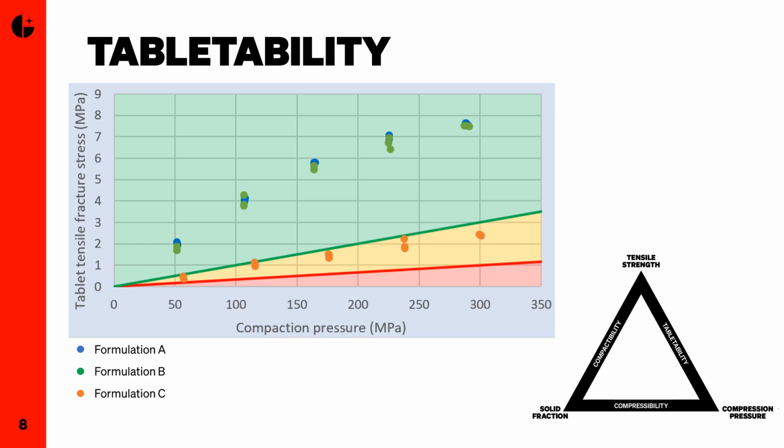We tend to presume that when you increase compaction pressure, there is a resultant increase in the strength of the tablet. But for a lot of materials, this is only true up to a point. For a lot of materials, the increasing hardness or strength of the tablet will plateau at a certain point as compaction pressure is increased, or it can actually decrease, which is when overcompaction starts to happen. I have a slide on that further on, but that's a very important observation from the tabletability data.